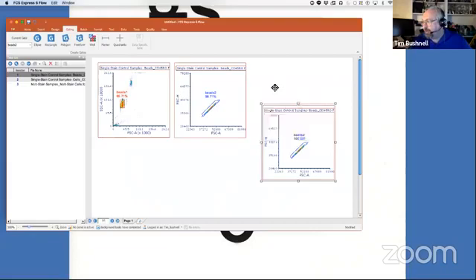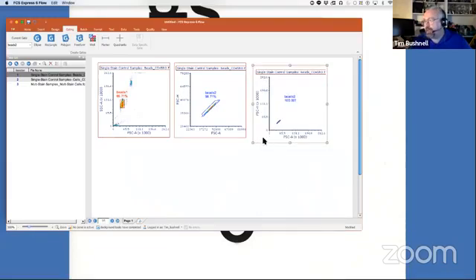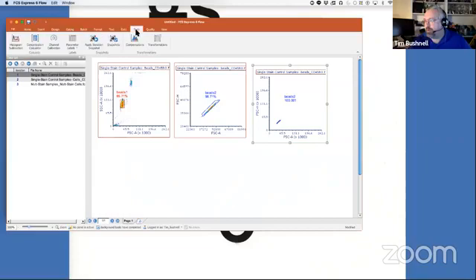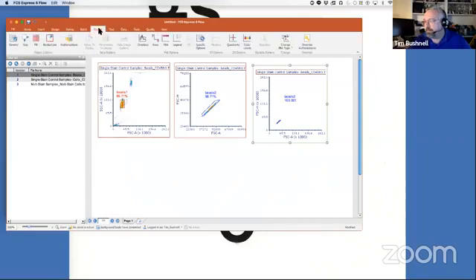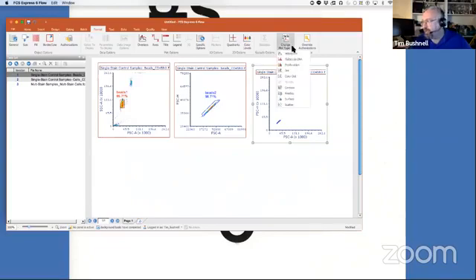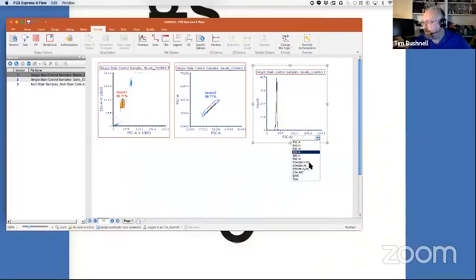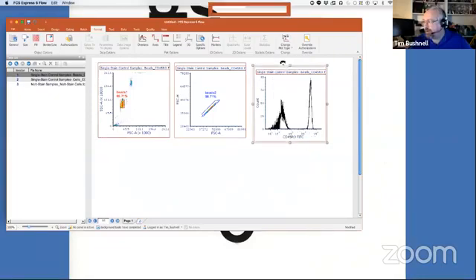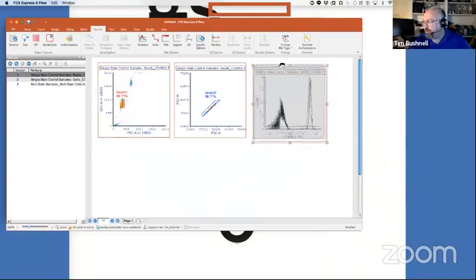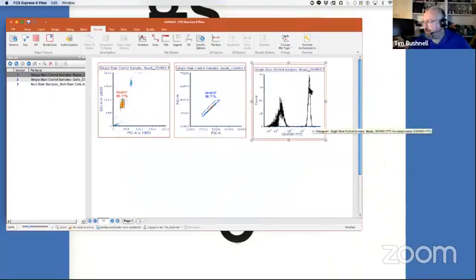So I'm going to bring this over here to my third. It's important at this point actually to go back and unmagnify. And what we're going to do is we're going to go over here to Format. We're going to change your plot type. And we're going to change your plot type to a histogram. And here we're now going to put this on the FITC, the fluorescein detector. So you can see very nice that we have a nice negative population, a nice positive population.